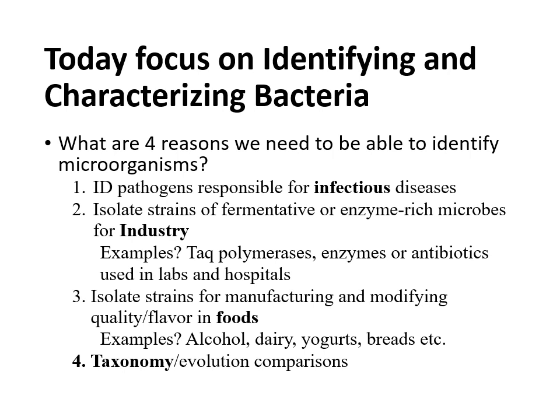Okay. So you really want to gain understanding and be able to identify or culture patients when they're dealing with different infections. Now, not all microbes are going to be looked at in the medical sense.